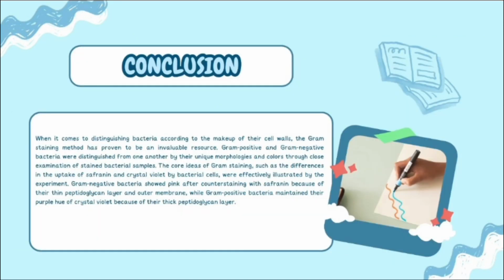For the conclusion, when it comes to distinguishing bacteria according to the makeup of their cell walls, the gram staining method was proven to be an invaluable resource.